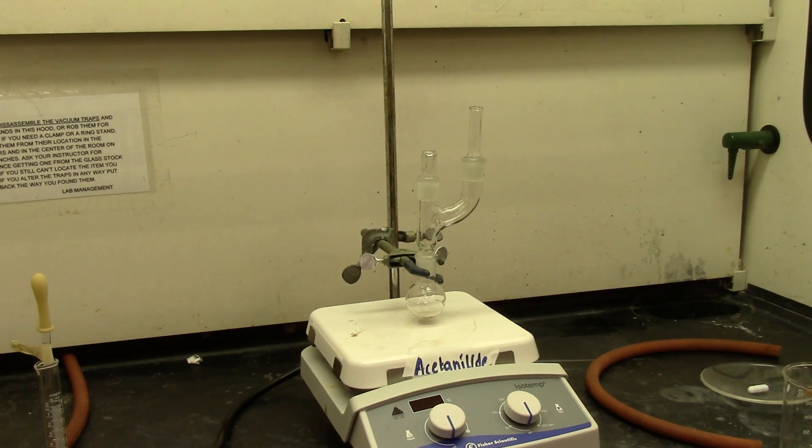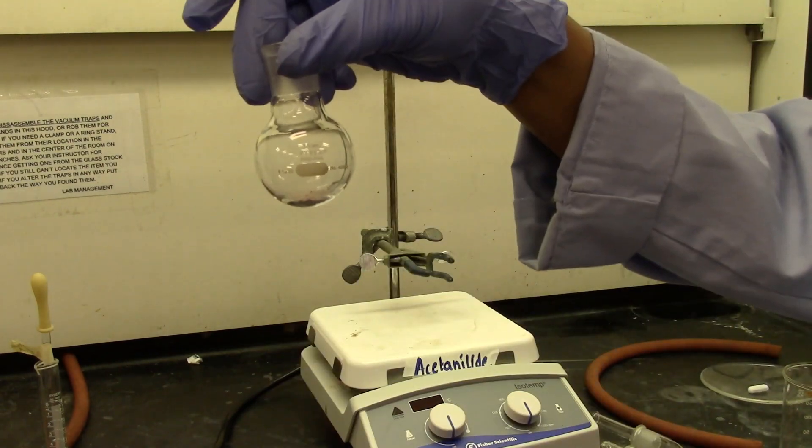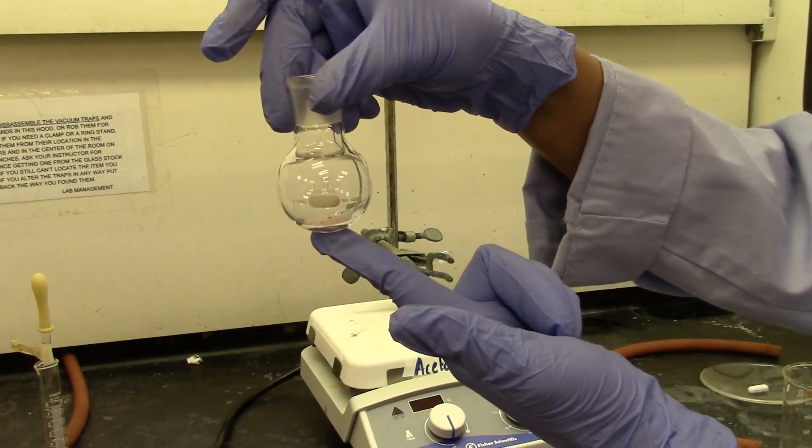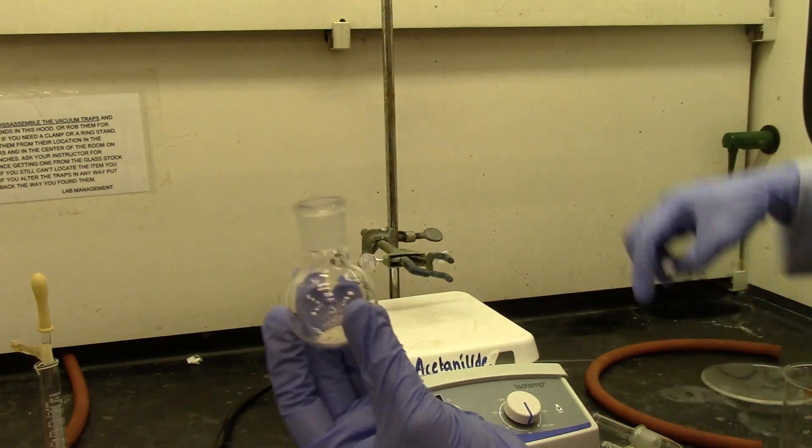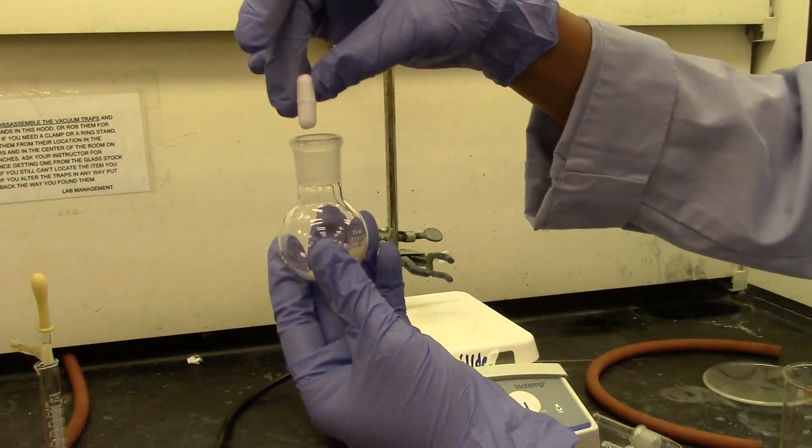So this is the bromination setup for acetanilide. I have labeled it since we have three different setups for aniline, acetanilide, and anisole. I weighed around 0.47 grams of acetanilide. As you can see, it's solid, and we're going to drop a stir bar in there.